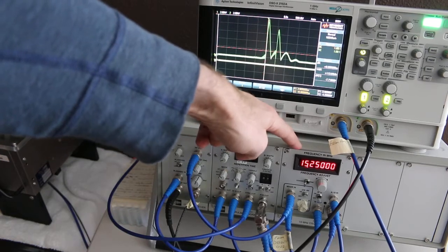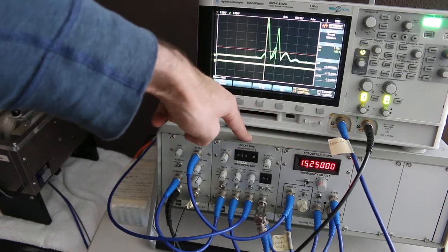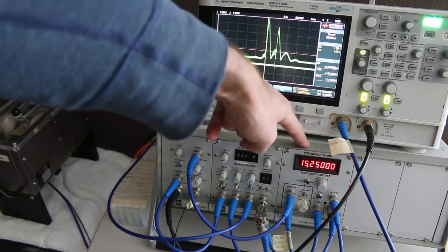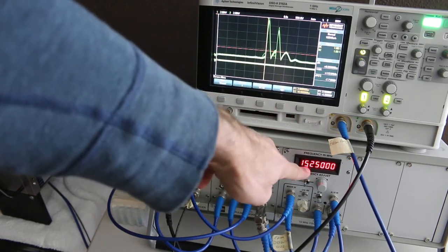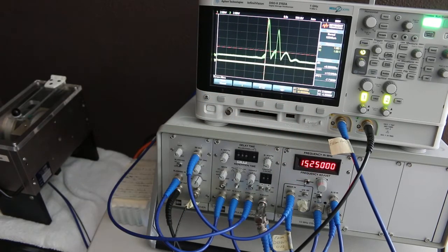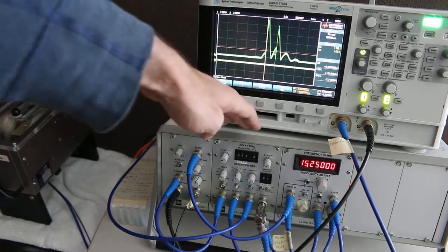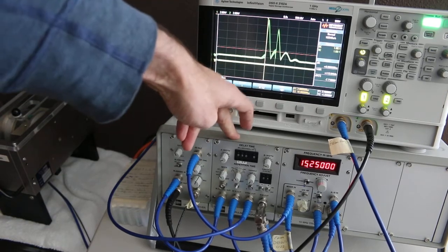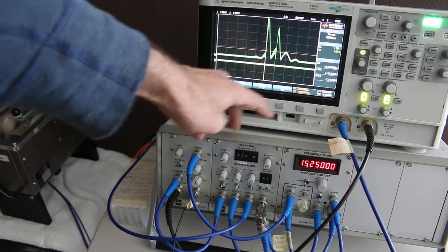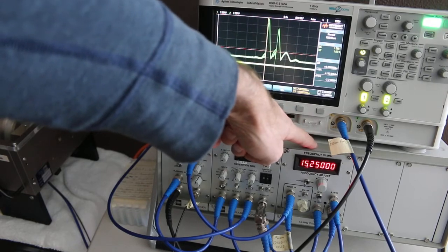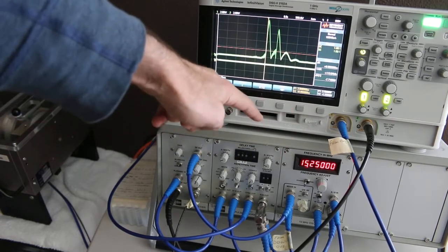It is also driven by the center part over here, which is the so-called pulse programmer. So this thing will generate its 15.25 megahertz, but it's gated or turned on and off by pulses that come out of this middle unit here, which is the pulse programmer. So think of it like an oscillator that can be turned on and off with electronic pulses that come from this.